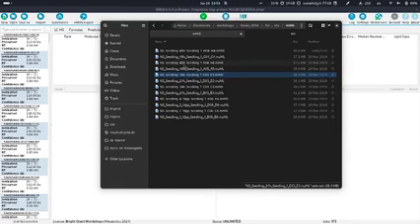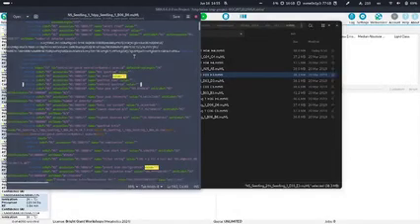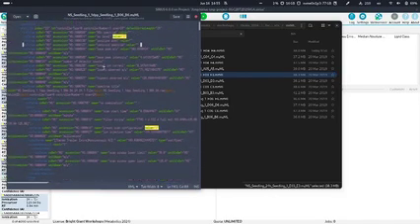For the mzml files, it's unfortunately not very nice to look at in a text editor, but it is definitely possible. And if you have, for example, MGF files, it's very easy to just open it in a text editor and look at everything. I will still show an example for the mzml file. Because it's 30 megabytes, it will take a little bit to load in a text editor, but it should look something like this. So everything is, in theory, human readable. And what I've highlighted here is that I've searched for value equals 2, which just shows me all the lines where some MS2 data is contained.